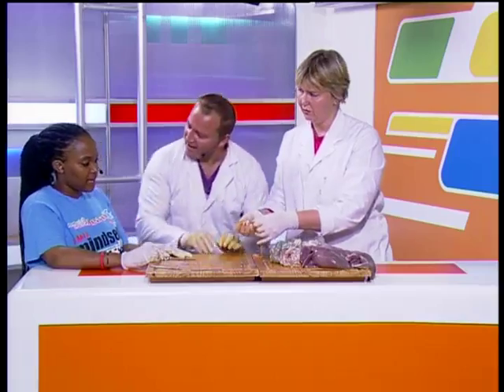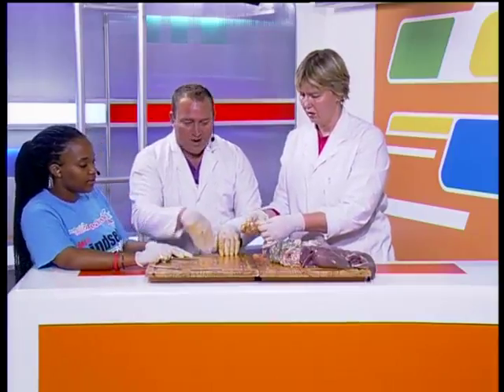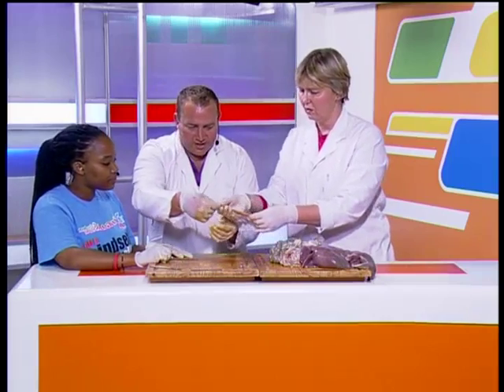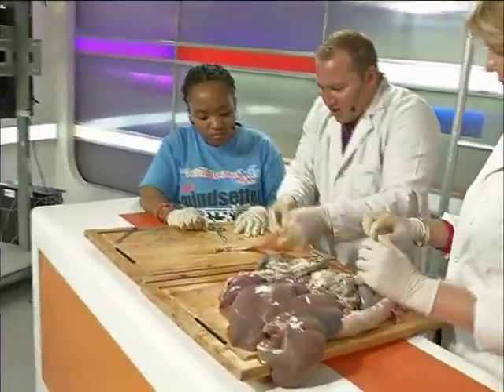It's different to the stomach, yeah? Yes. And the other part, what was that part called? The first part? The esophagus. Yes. Nice. Different. Well, let's open it up and have a good look. They're like striations. How cool is that? But now let's open this thing completely.